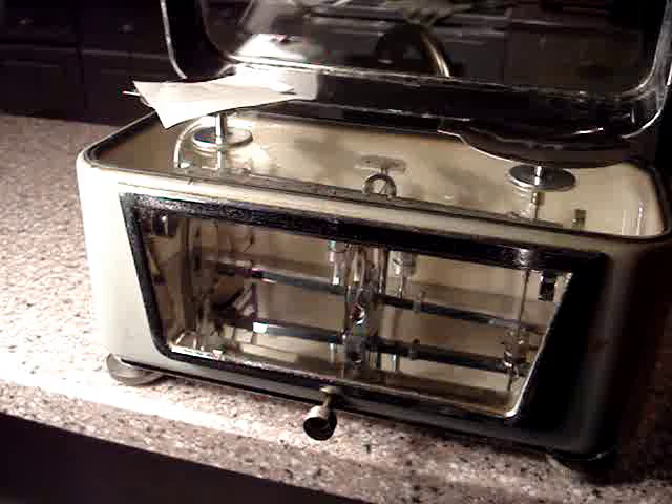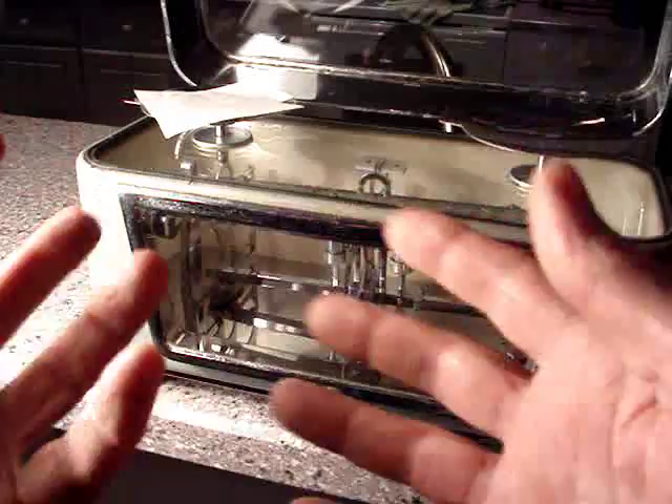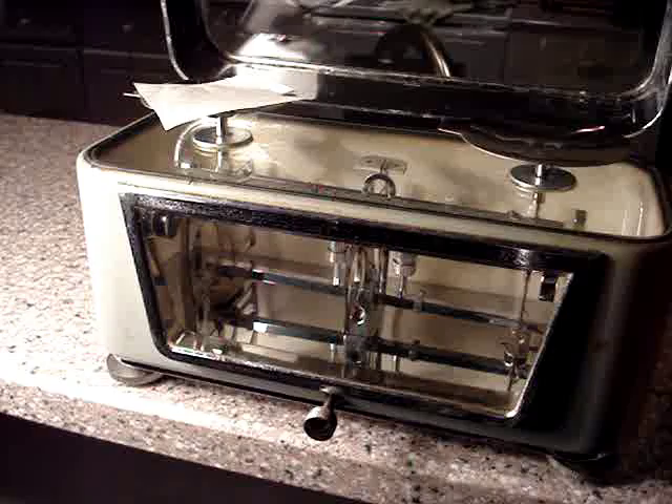I call it a hair beam, but the correct name is a torsion beam balance. Purely mechanical — it's a vintage deal. Here it is for your viewing pleasure. Think it over a little bit. My name's Dave — I got some extra stuff for sale here.